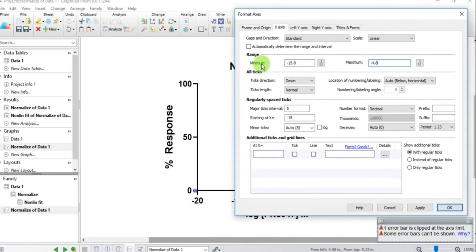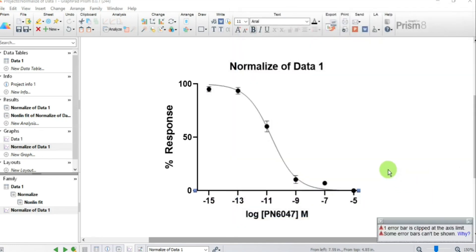Set the major tick interval to 2, with the starting X-axis tick at minus 14 — so it effectively starts at minus 15. Hit OK. The Y-axis and X-axis are now properly sorted.